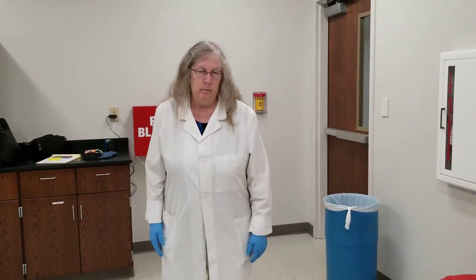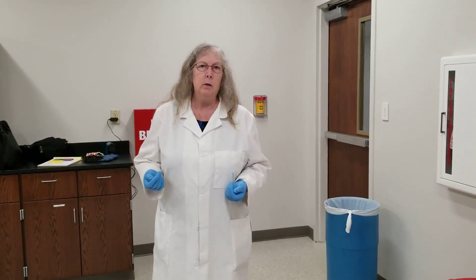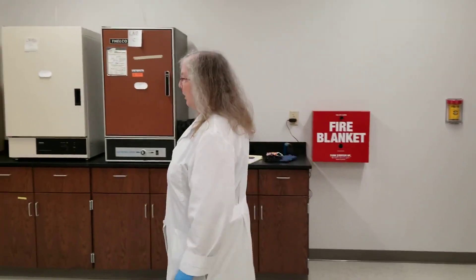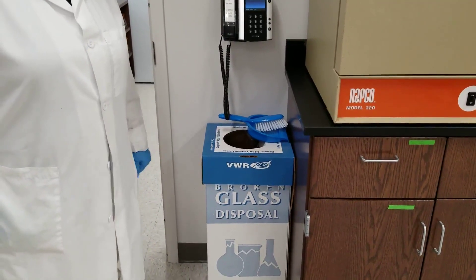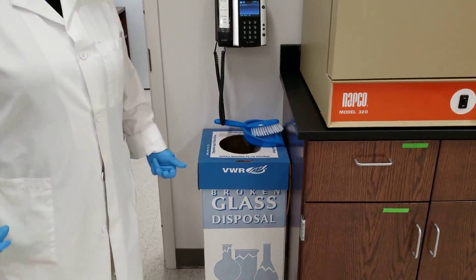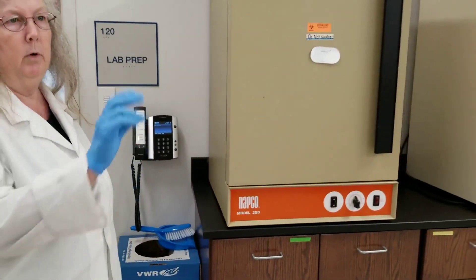There is another type of disposal, and that is for broken glassware. We understand accidents happen — it's a fact of life. You may be working with a beaker of water, or getting a slide out to prepare a stain before you've put bacteria on it, and it breaks. You cannot put broken glass in the regular trash can — that is a hazard to our custodial staff, and we want to protect them. So broken glassware goes into a box we have here, nicely labeled as broken glass disposal — you just drop the broken glass in. If you do break something, let me or your instructor know so we can properly clean up and make sure nobody was cut or injured. Broken glassware that is not contaminated goes here; if it is contaminated and sharp, it goes in the red sharps container.